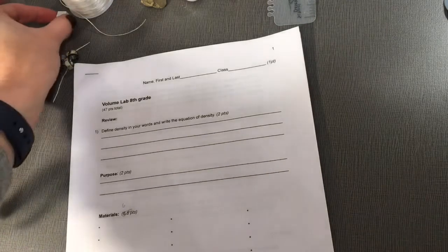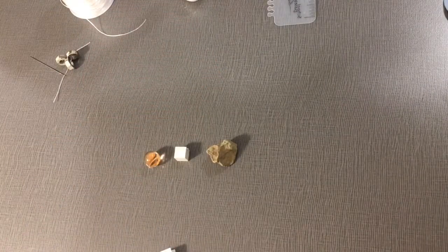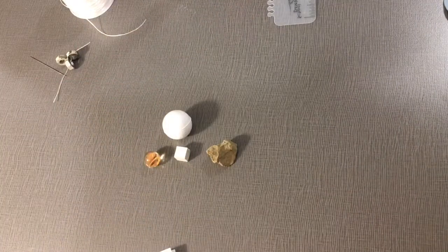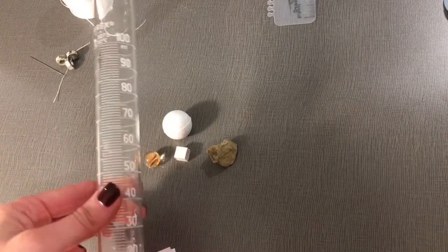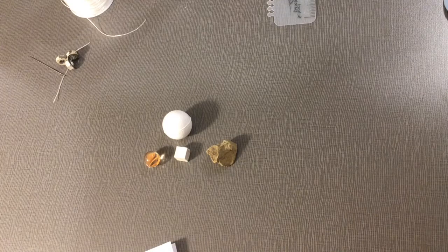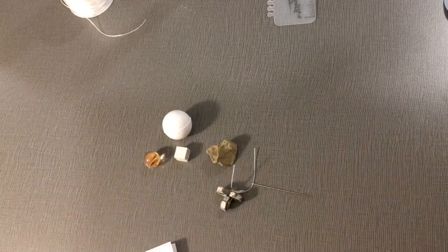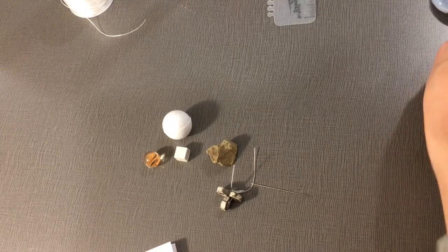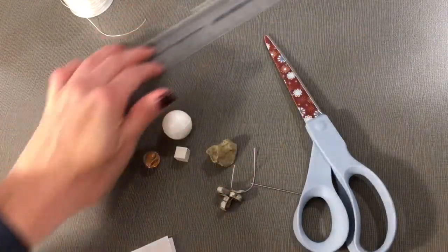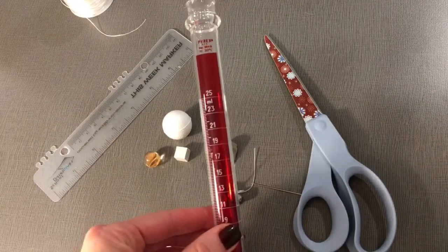Your materials include a 1 centimeter cube, 1 glass marble, a sandstone rock, a styrofoam ball, a 100 ml graduated cylinder, a triple beam balance, one to 3 sinkers, string and a needle, a pair of scissors, your metric ruler, and a 25 ml graduated cylinder.